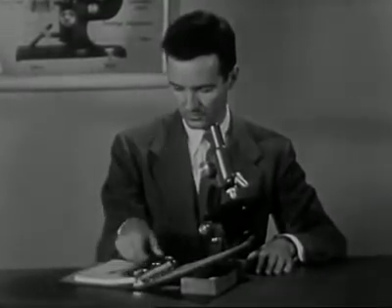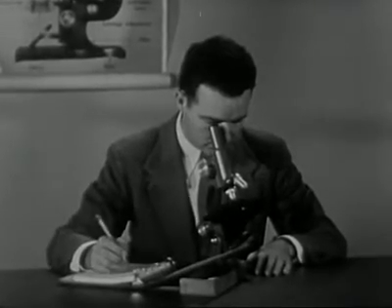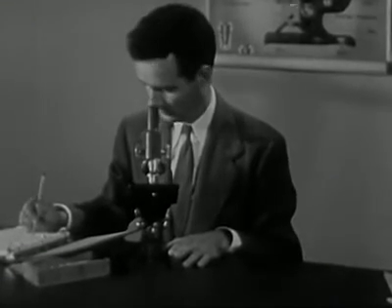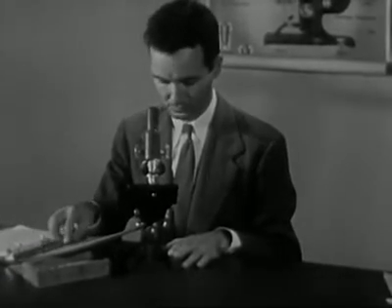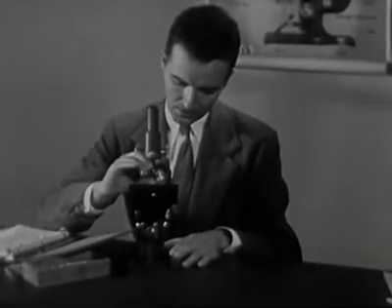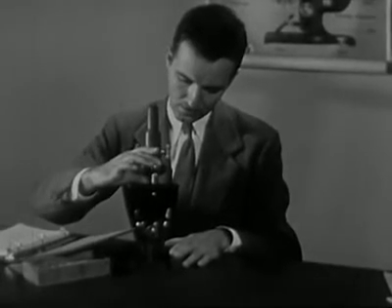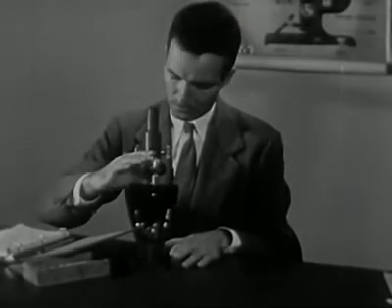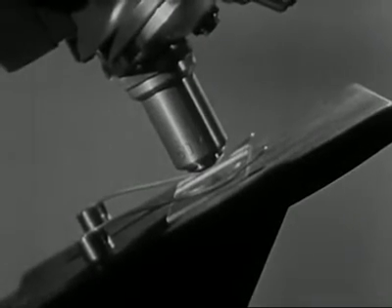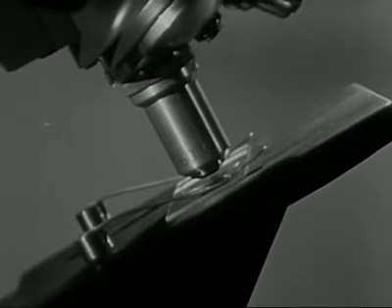Most of your studies of the small plants and animals will be done using the low-power objective, since the low power gives you a better overall view of most plant and animal structure. You will use the high-power objective in some of your studies of cell structure, however, and it is important to know how to use it correctly. First, turn the revolving nose piece until the high-power objective snaps into place. Now, before focusing, carefully adjust the high-power objective until it is very near the top of the glass slide.